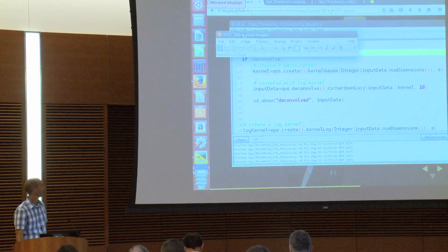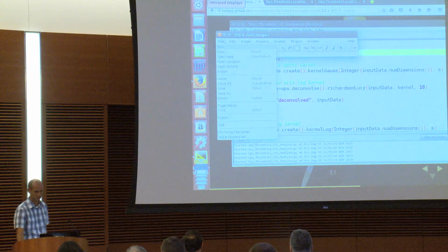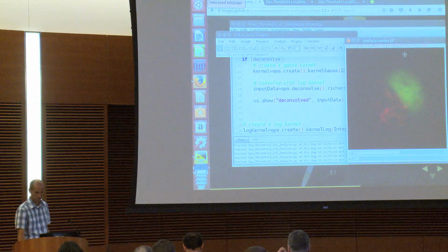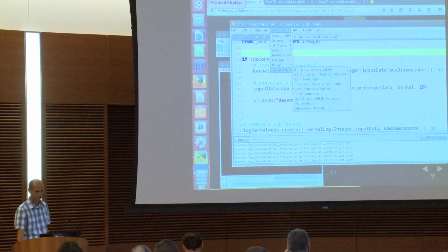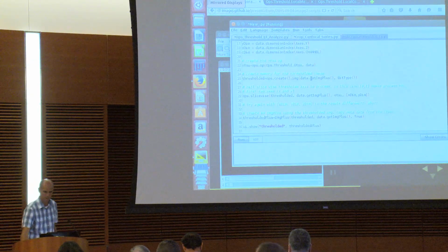So anyway, I closed all my images. I used Shift W. So I'm going to start a little bit cleaner, then open samples again, and open up the confocal series image. Now, go to templates, tutorials, and this time we're going to do slice-wise threshold.